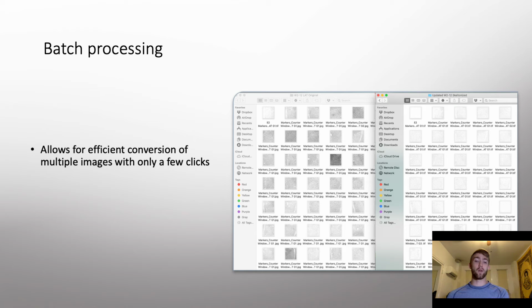As I'm working with fairly large regions of the brain, hundreds and hundreds of images are taken, and this leads to having thousands of data points. So having this process of data collection optimized is really essential for timely completion of any work.